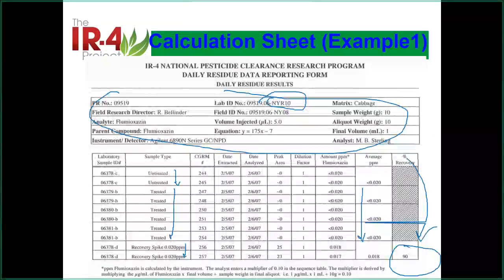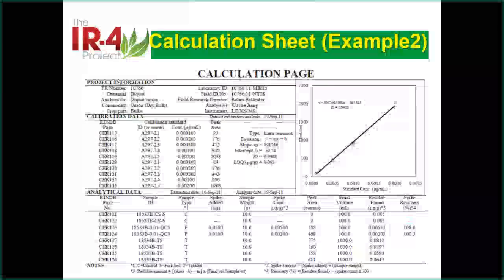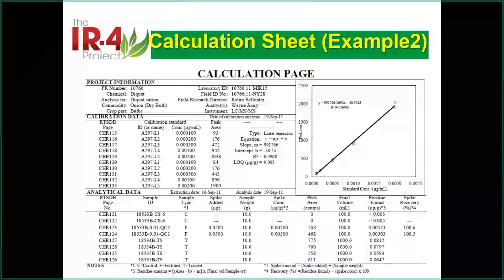Okay, so that's okay. Let's look at the Michigan State lab. What kind of format do we have? We have a similar one, but I personally believe our form is better than theirs, but it depends on your opinion, of course. So this is our form. We have a calibration curve there, which makes it a little bit more straightforward. You can see it right away.